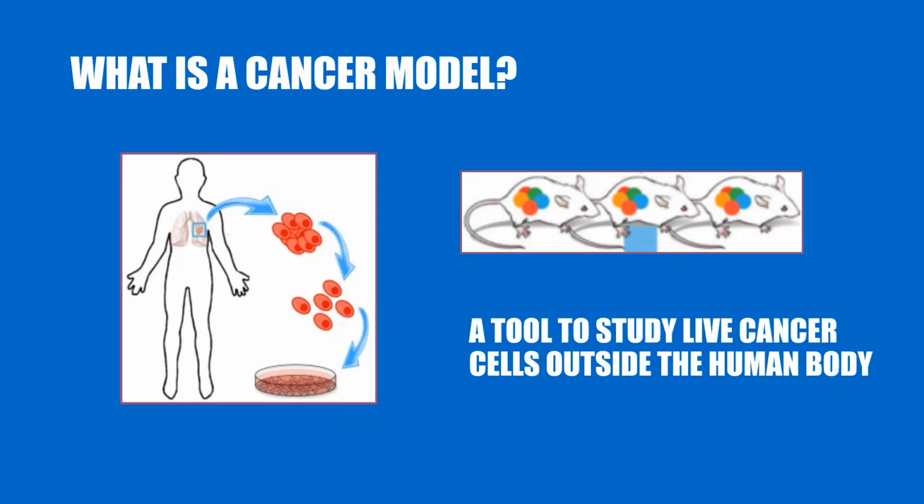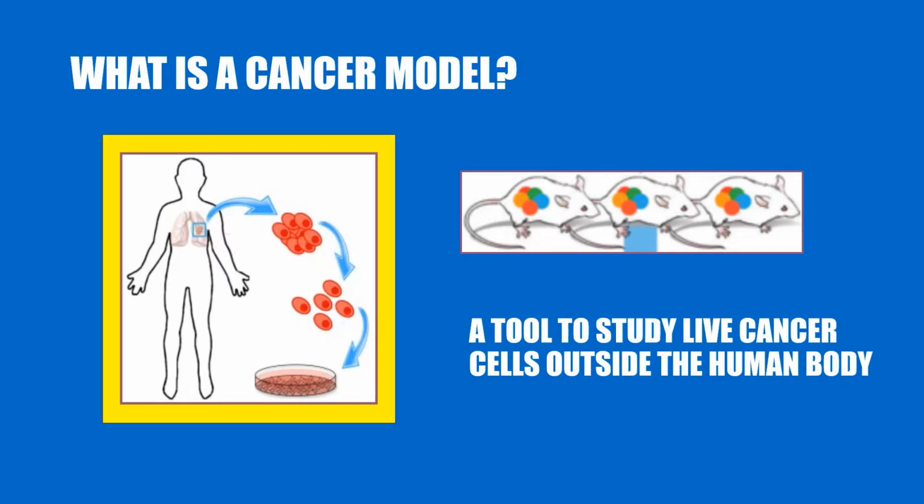Researchers use these models to study cancer biology and develop new treatments in the laboratory. Today, we're going to focus on cell lines derived from patient tumor cells by touring a lab at the University of Colorado that makes and studies cell lines.